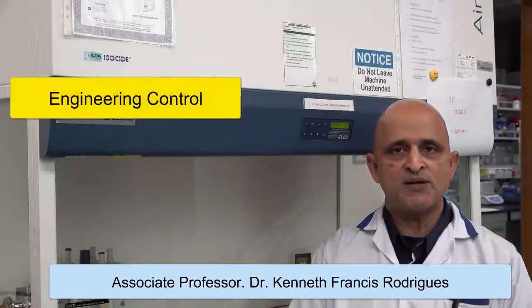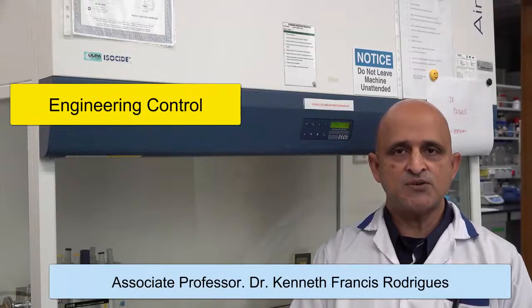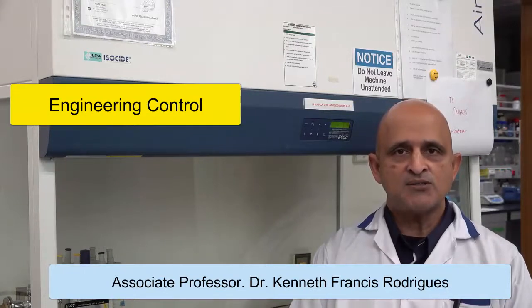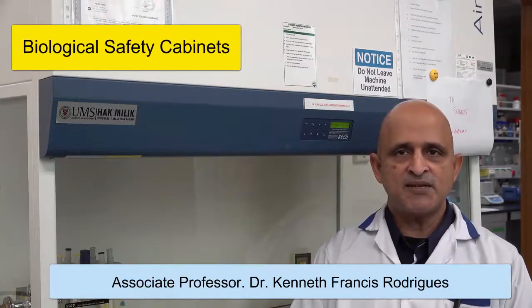Hello and welcome to this module which will introduce you to one of the key engineering controls. Biological safety cabinets offer a safe working environment in which both the operator as well as the sample are protected from extraneous contamination.